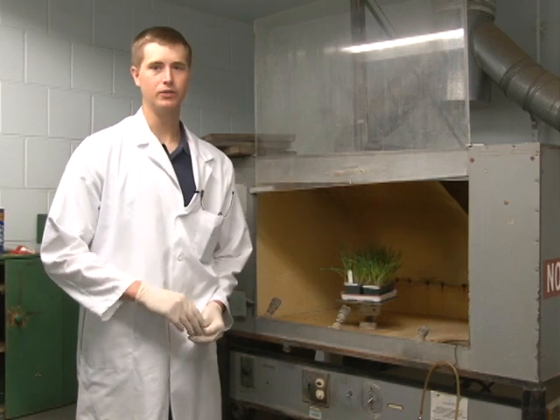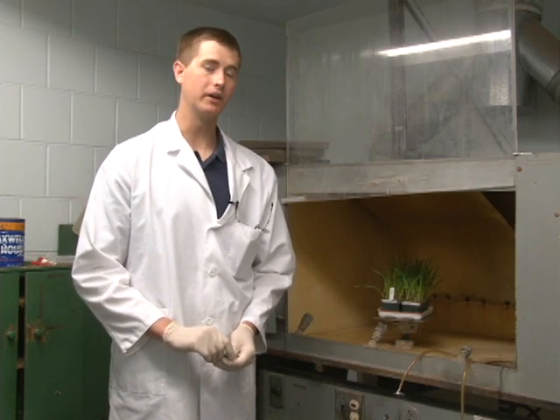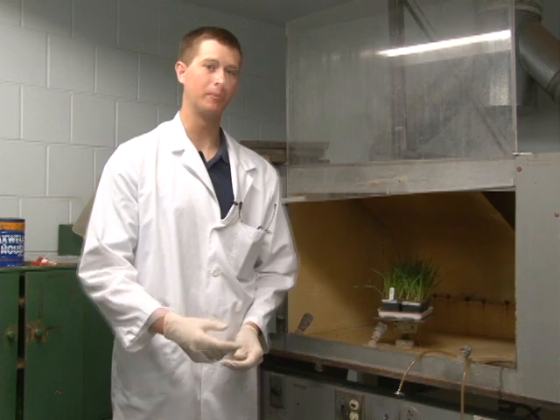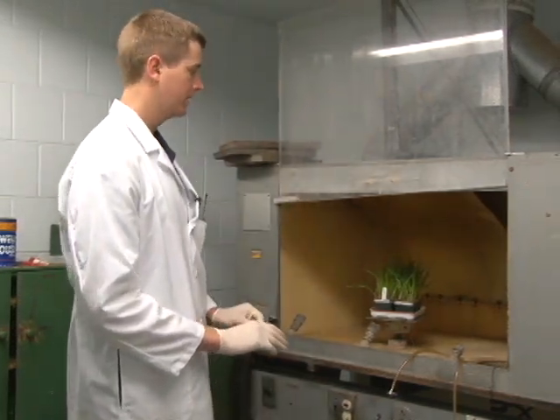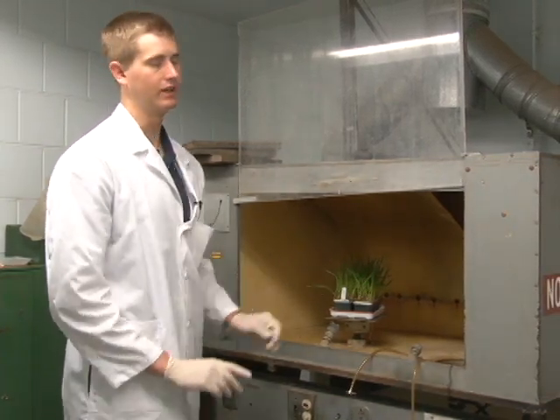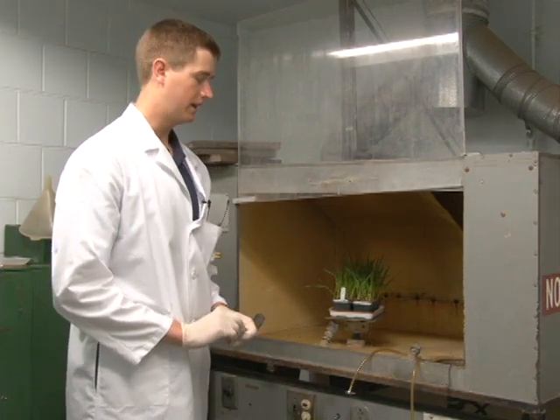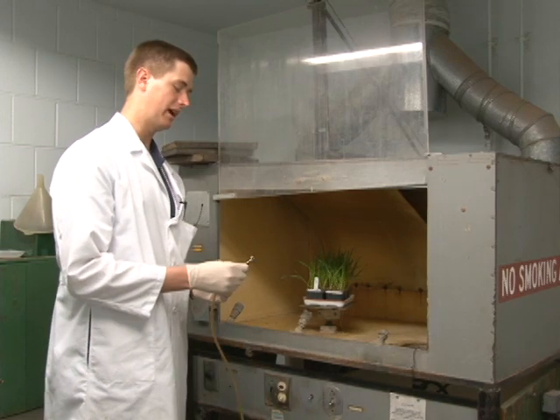I'm now going to describe a relatively faster method of inoculating plants. If you have a lot of plants or several different isolates that you would like to inoculate, you might want to use a vacuum pump to speed things up. Right next to me is an inoculation booth — an enclosed chamber with some plants inside that we would like to inoculate — and this is a tube that's connected to a vacuum pump.